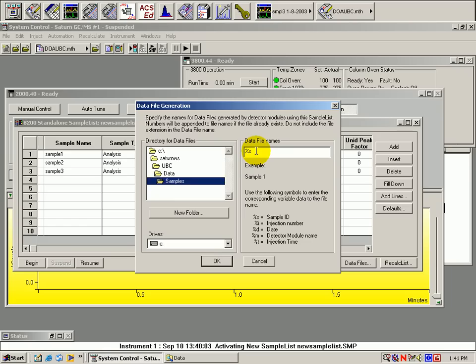Once you have decided where you are going to store this data, fill in the additional identifiers on the right side of this panel.